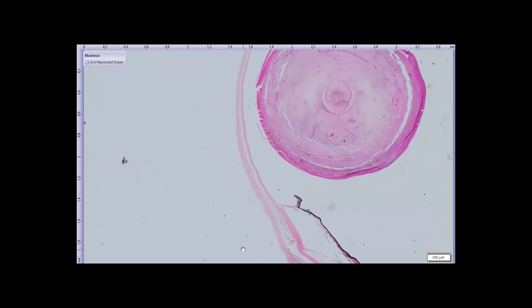Notice that the corneal stroma has two components. One component that's continuous with the integument, and then there's another component that's continuous with the sclera. And so sometimes some people refer to the fish cornea as having a spectacle, so a two-part cornea. I've never really adapted that, but you'll see that in the literature.